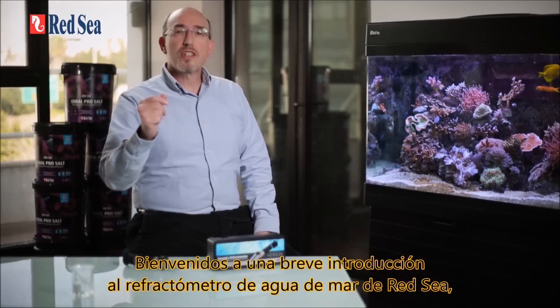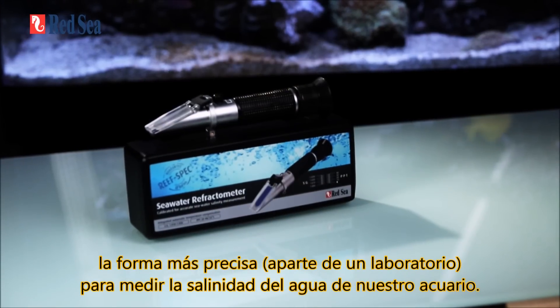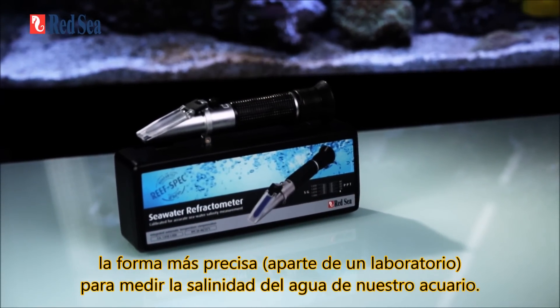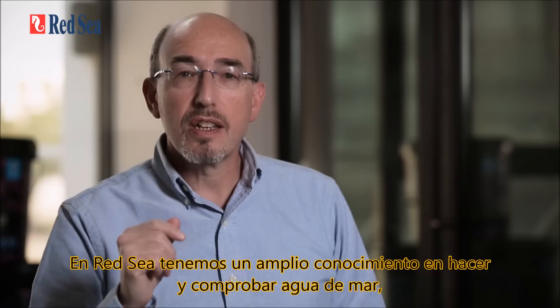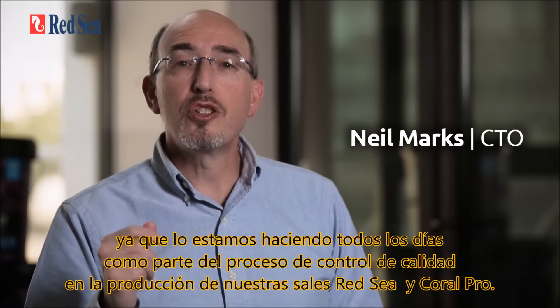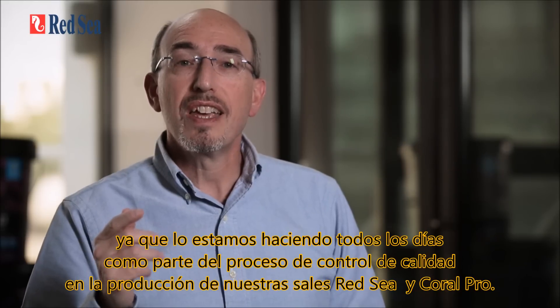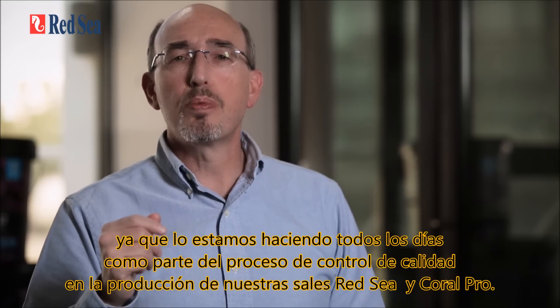Welcome to a short introduction to Red Sea's seawater refractometer, the most accurate way outside the laboratory to measure the salinity of our water. At Red Sea, we have an in-depth knowledge of making and testing seawater as we are doing it all day every day as part of the quality control process in the production of our Red Sea and Coral Pro salts.